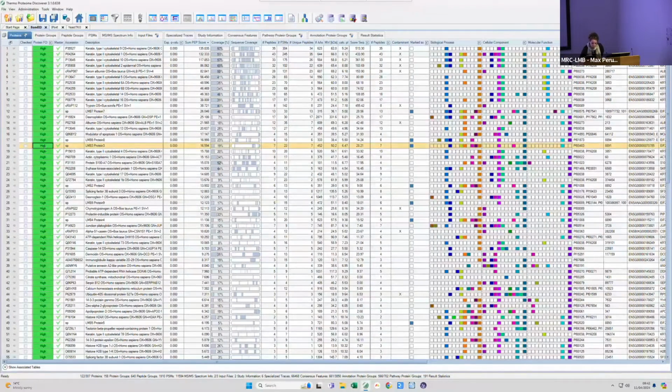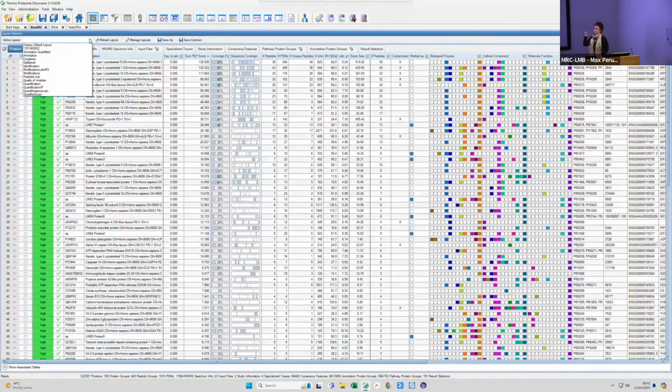So one way to limit this information, you have this window here, that's the layout selector. If you click on here, there are already several factory or default layouts that you can use. Some of them you can create yourself once you get a little bit more proficient in how to use the layouts.